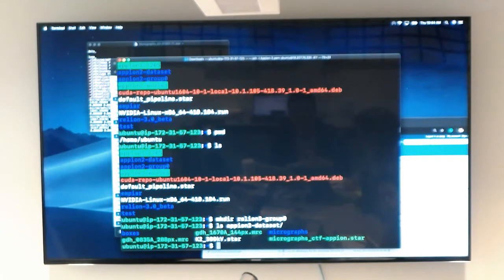I'm choosing an odd box size on purpose to show you that you don't necessarily have to have 256, 128, 512. Certain programs allow you to further bin in the sense that you don't actually have to bin by an integer. In Appion, depending on which program you use, it forces you to bin by an integer because not all packages are intercompatible. But in Relion or Cryosparc, you can actually Fourier bin, so you can bin by a fraction, like 2.5. This is to show you that you can choose box sizes more appropriate based upon your pixel size and your protein of interest.